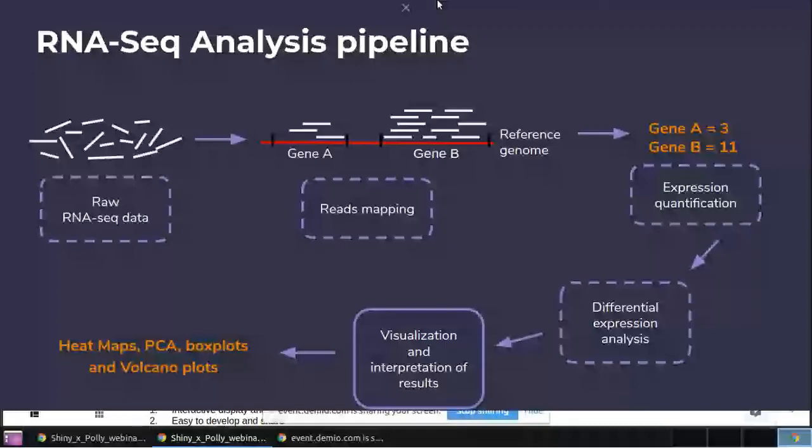But the whole pipeline that we usually follow is very, very tedious. And what we get would be just plots, and probably a list of genes that are overexpressed or underexpressed. This kind of analysis needs to be aided with something visual, and it's not just about being visual, but also being interactive. Because in a simple report that one shares, we often have to go back to see what the expression values are, and where a gene lies in the actual plot. And if we were to filter the data for some specific genes, how would things change? So the app that I'm going to demo now would show how we can visualize these things, and also how an interactive interface helps us interpret better.